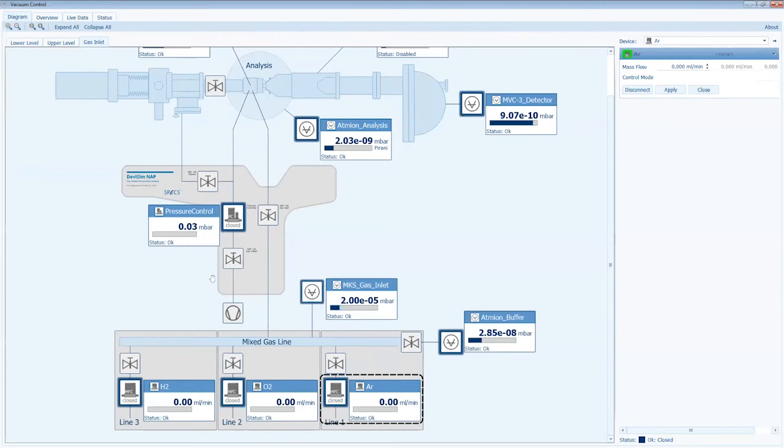Yeah. So here, the NAPXPS also has its outlet. So there is a pressure controller, which is something like a controllable outlet for pumping. There is a device which can change the diaphragm, the aperture, for pumping. There is a turbo pump connected here. It pumps with some speed. However, of course, this speed depends on the size of the aperture which is used for pumping.